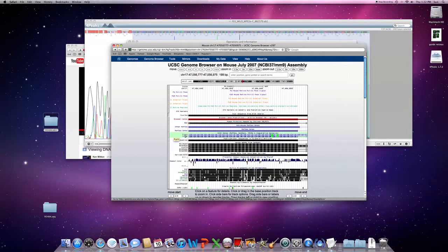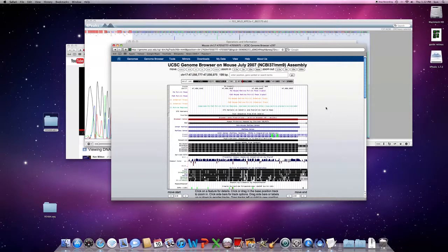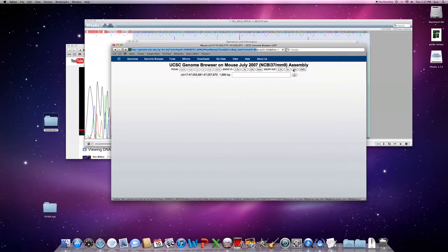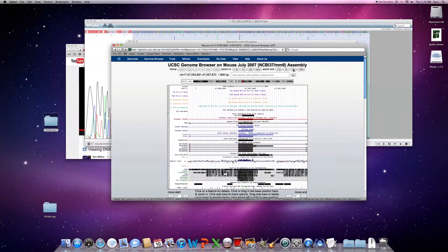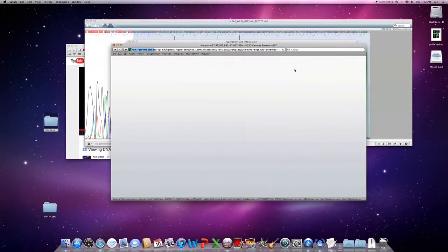That's where we expected this wild-type PCR product to come from, because this is a PCR test to see if a mouse has at least one or two copies of the normal non-mutated peripherin 2 gene. So I'm just going to zoom out here about 10 times so we can see where we are in the forest. And again, here's your sequence that we've made a match. You can see it matches in this exon sequence of the peripherin gene. I'm going to zoom out again 10 times.